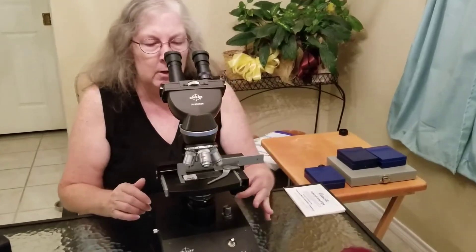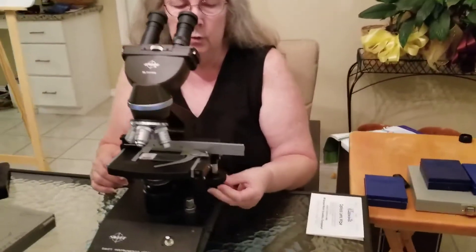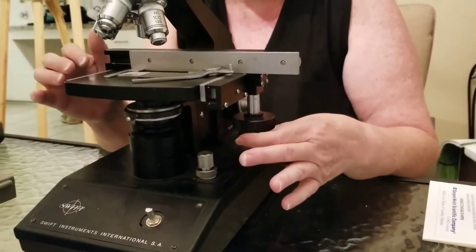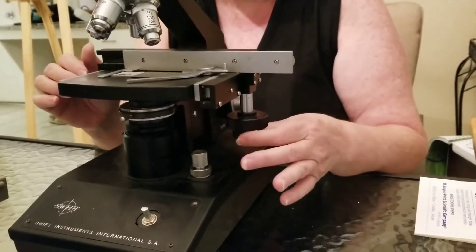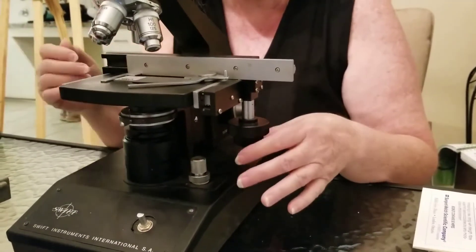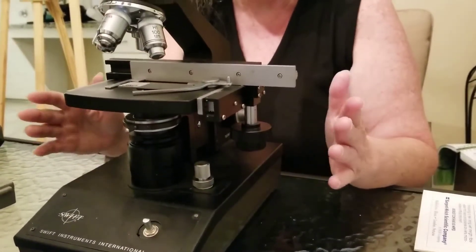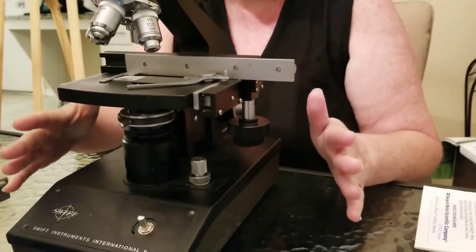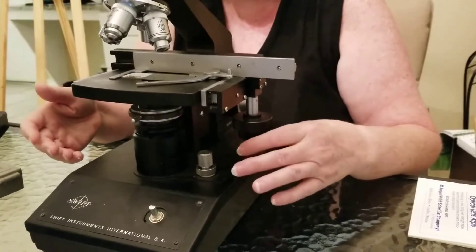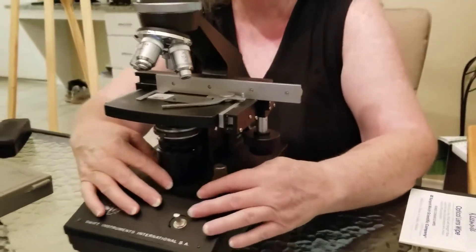There are two different knobs over here. The bottom one is going to move the clamp holding the slide left to right, and then front to back, so you don't have to move the slide around by hand. It helps the clips hold the slide nice and secure, and this will move it so you can position it how you want.